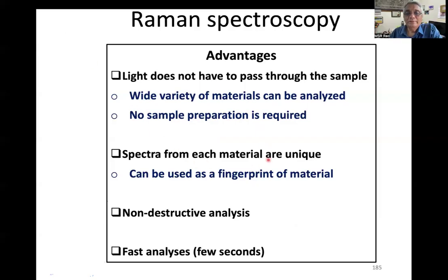Spectra from each material are unique. I also mentioned this, that you get signature fingerprint patterns of each material, like the fingerprint patterns available when X-ray diffraction is done.